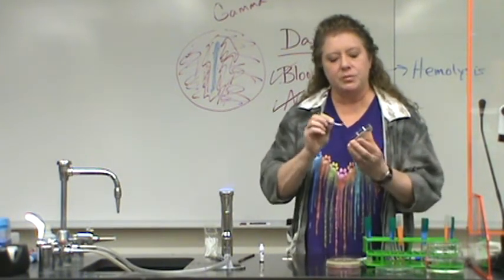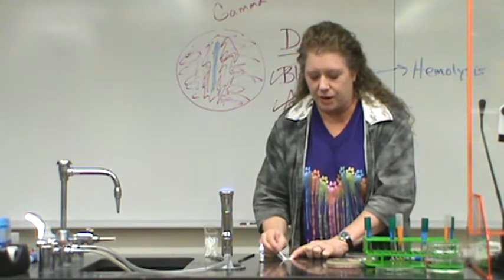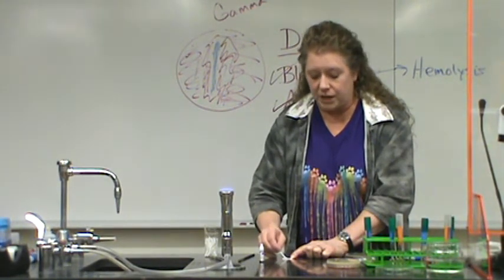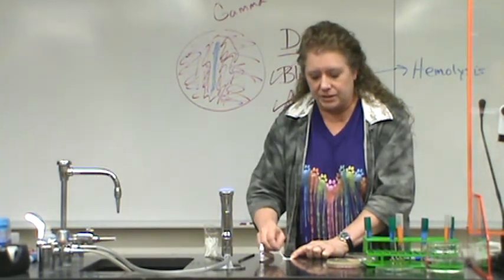Pick up your TSA plate of your isolate number 1, get a little clump of bacteria on it, and then you're going to swish it around really good in that drop of reagent. It has to be done for probably, I'd say, 10, 15, 20 seconds. Okay, you want to swish it around really, really good.